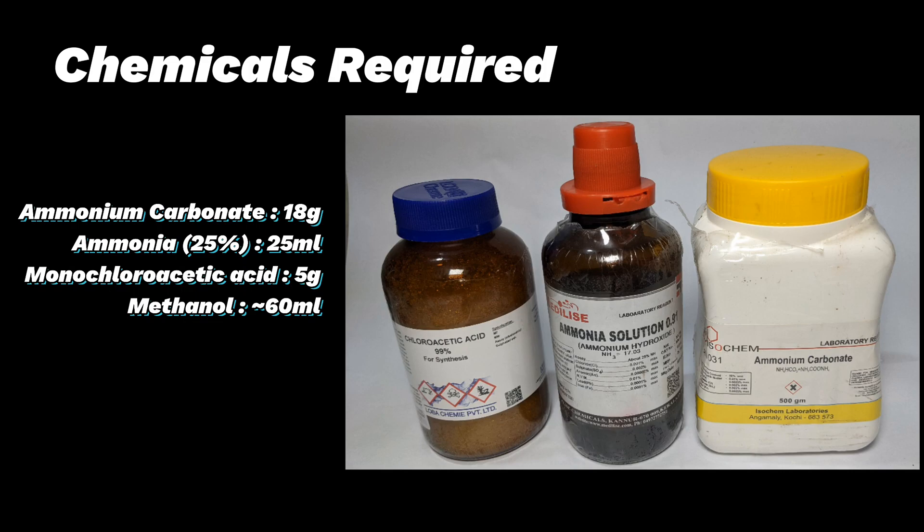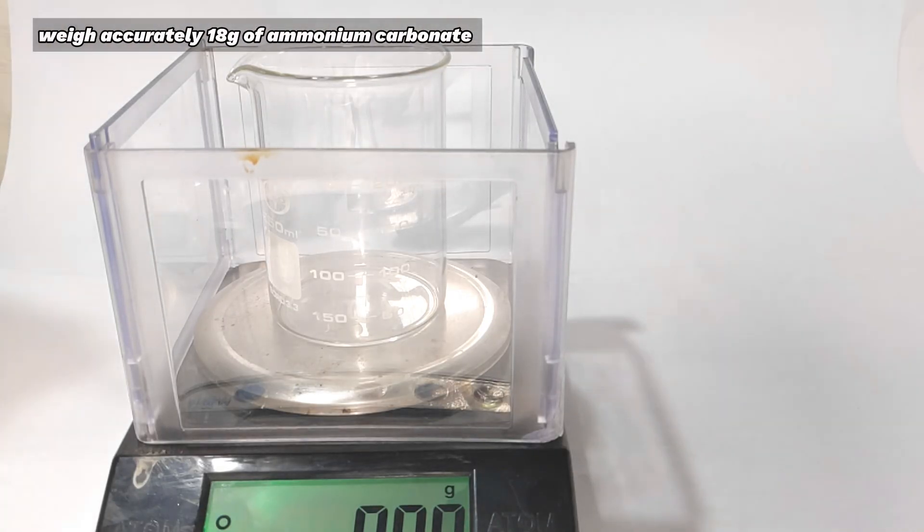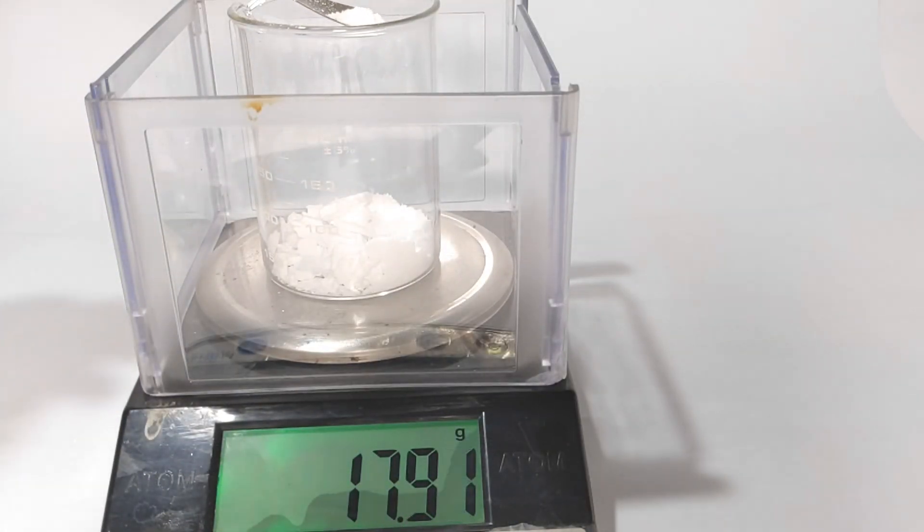Chemicals required for this experiment are 18 grams of ammonium carbonate, 25 milliliters of concentrated 25 percent ammonia solution, 5 grams of monochloroacetic acid, and approximately 60 milliliters of methanol. Start by weighing 18 grams of ammonium carbonate. It's a white powder with a strong smell of ammonia. Here I am using lab grade purity compound.